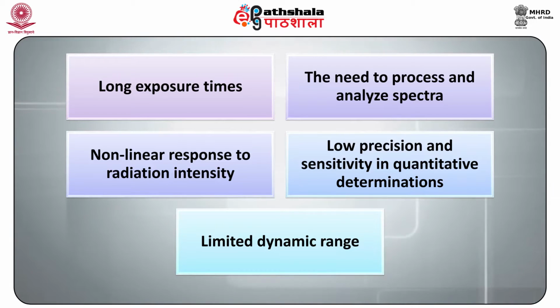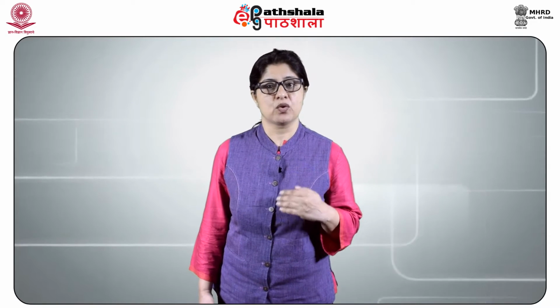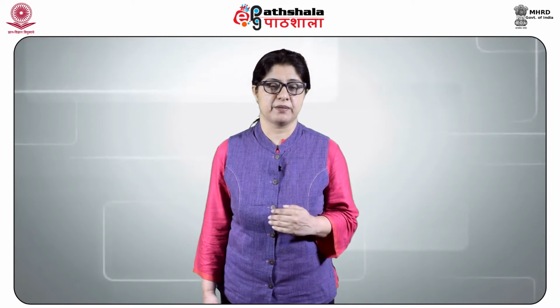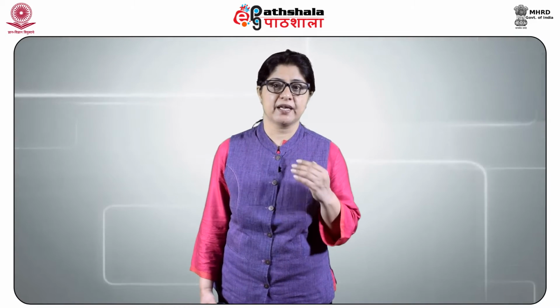Limitations of emulsions are long exposure times, the need to process and analyze the spectra, non-linear response to radiation intensity, low precision and sensitivity in quantitative determinations, and limited dynamic range. Photographic detection. Photographic materials consist of light sensitive emulsions coated on a glass plate or plastic film. The emulsion contains light sensitive crystals of silver halides suspended in gelatin. On exposure, the silver halide crystals that receive radiation form the latent image.